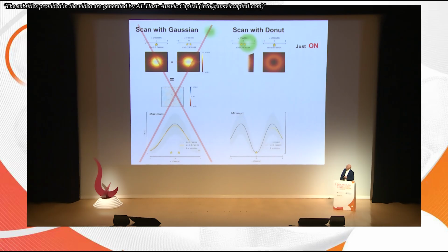But what happens if the two are slightly apart? If they are slightly apart, no way that there is a zero here, because when the zero of excitation light coincides with this molecule, there will be fluorescence from the other molecule, and vice versa. When the zero coincides with that molecule, there will be fluorescence from this one. If the zero is in between them, both will emit light. So in other words, here at the center, no way that there is a zero. If you make the subtraction now, you will see, yeah, this is a measurable difference. So I can decide whether it's this case or that case, because there's a measurable difference. And if you look at the profile, of course, now the profile of the two where they're separated is clearly out of the noise band. Clearly out of the noise band. So the black one is the one where they sit in the same place.